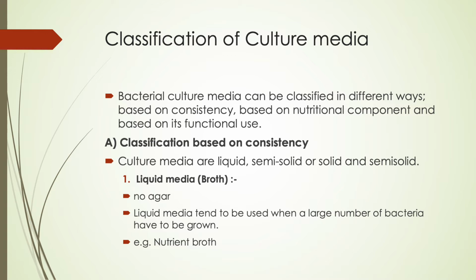For example, you will say, okay, I want to transport that bacteria from one place to another. At that time, what do I need? I need a transporting media. No, you will ask another question: I need to culture the bacteria, so we need some specific media for culturing. We have many types of bacteria. For example, you would say, I need to isolate or culture only gram-negative bacteria. So we need a specific media for only gram-negative bacteria, and we need to suppress or kill all the gram-positive bacteria.